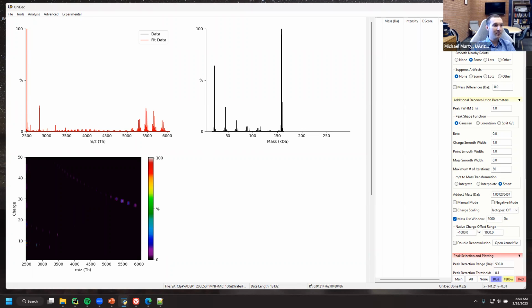Anyway, so it is starting to fit some noise into each of those ranges. So I don't know if I would trust it, but it is a way to limit what mass species are available. Yeah, there's lots of crazy stuff you can do. That's all super cool.